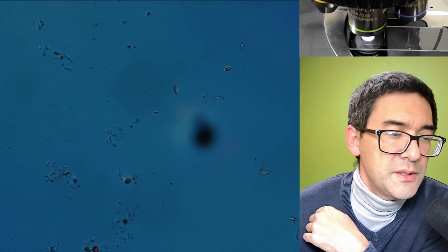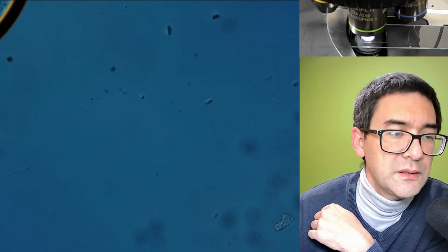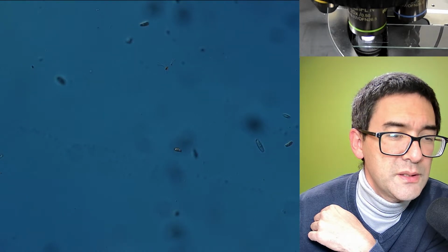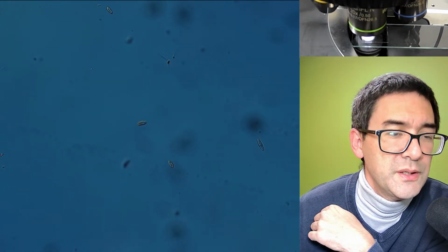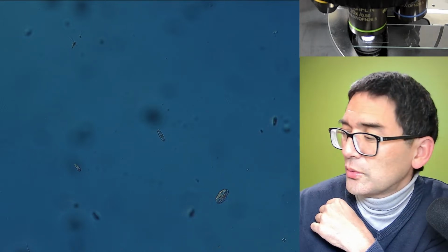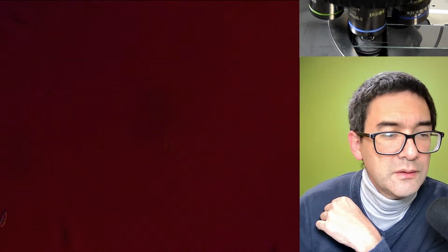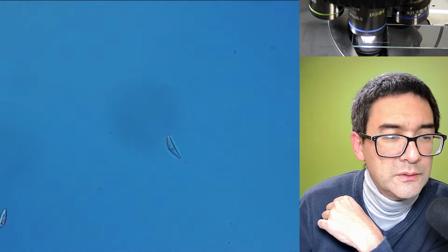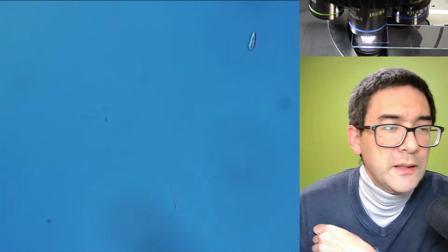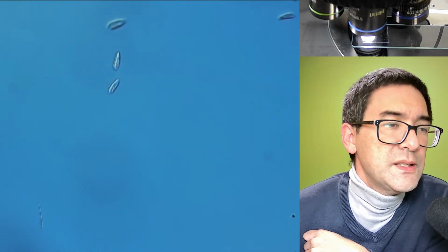Here we see, now we see those single-celled organisms. Yeah, there are a whole bunch, a couple, this one is in the center. Let's see some diatoms as well. Let's go up yet further. It's a little too dark, I think. It's a diatom. So, yeah, the further I go up with the magnification, of course, the more difficult it is to focus it.